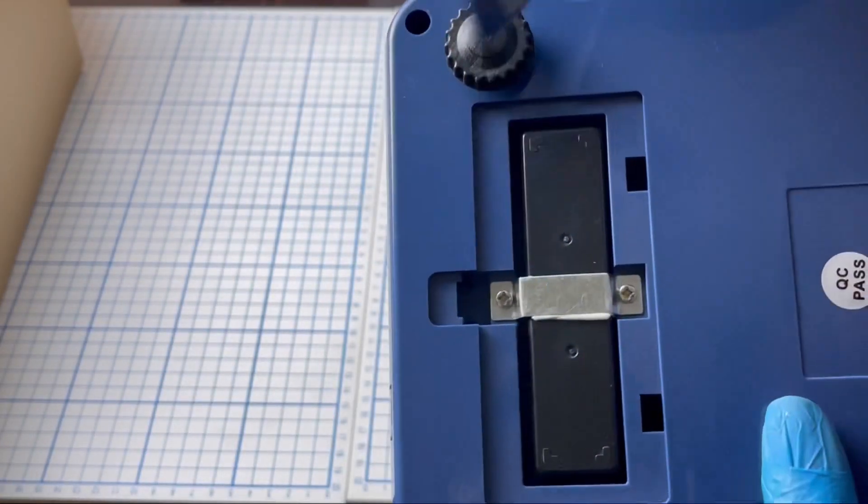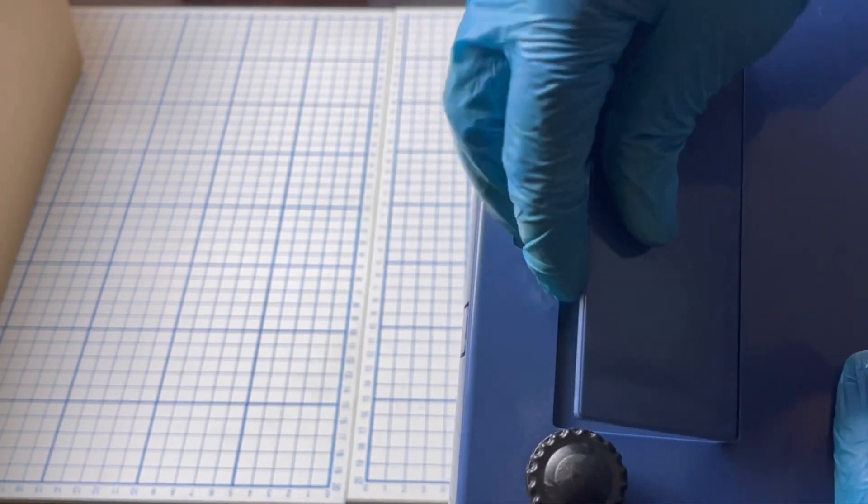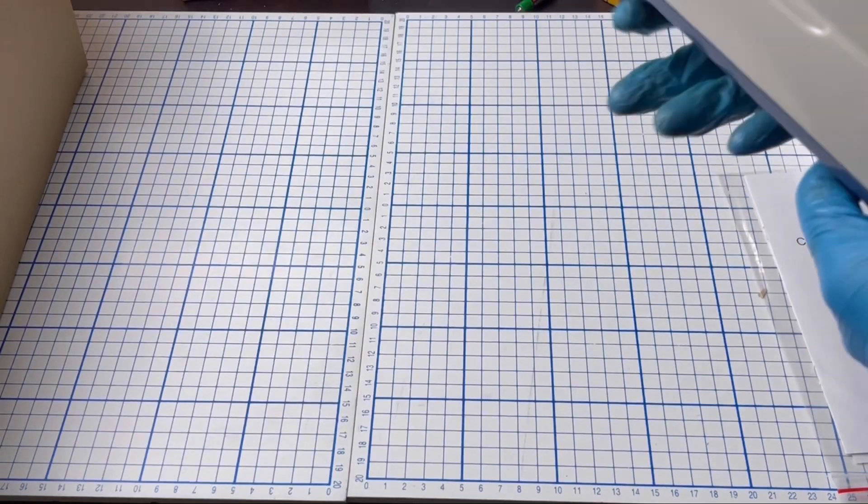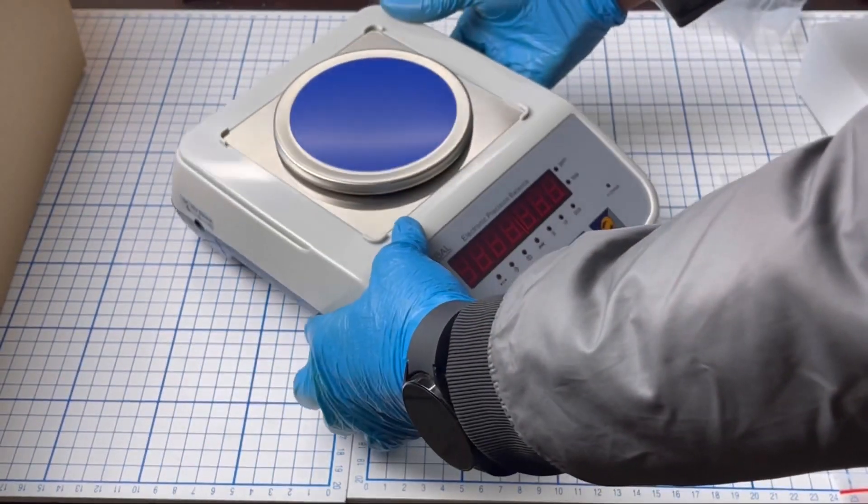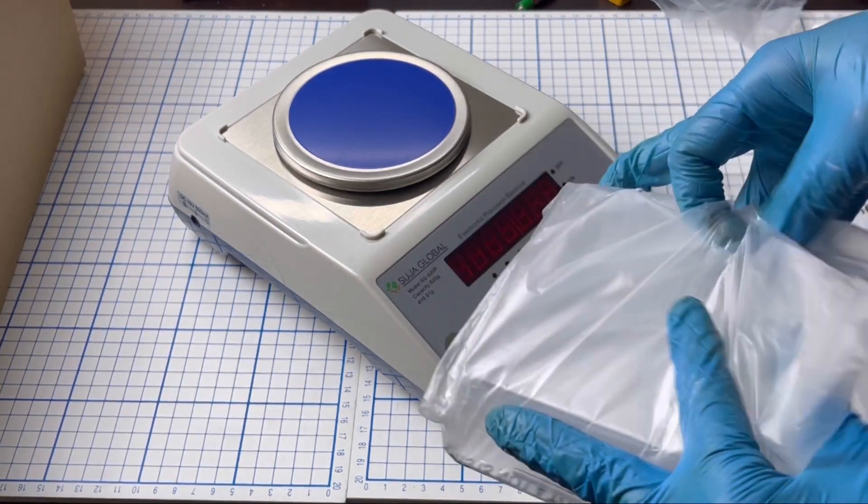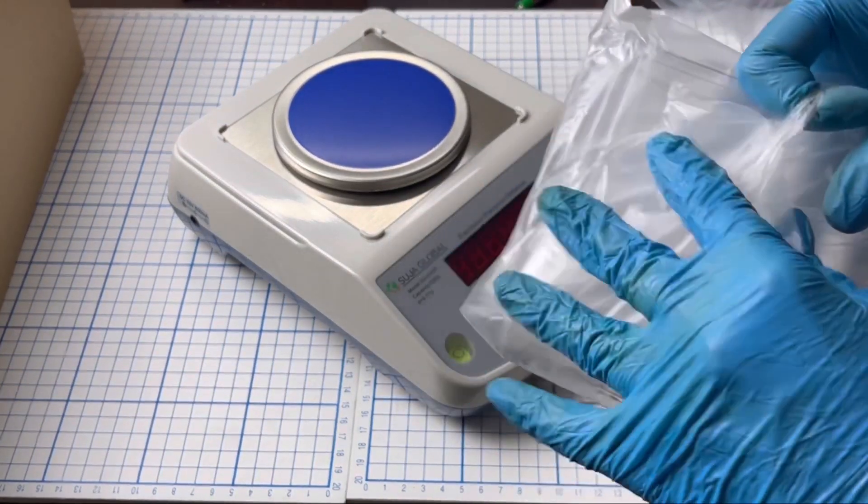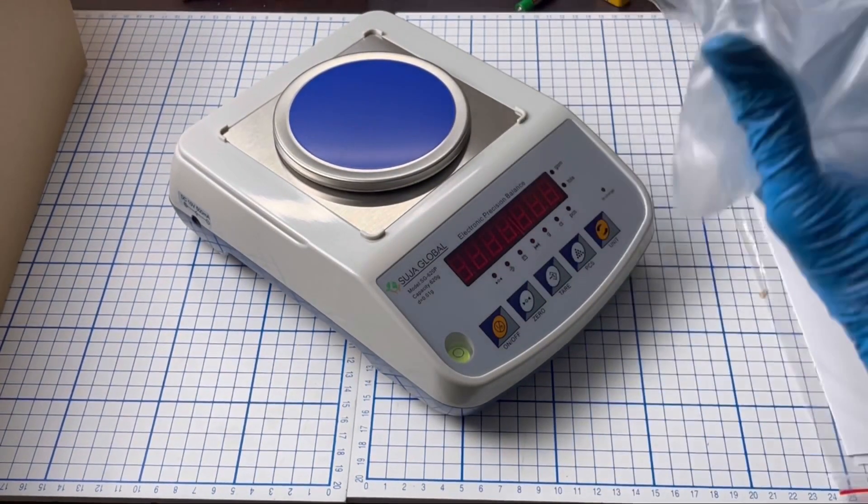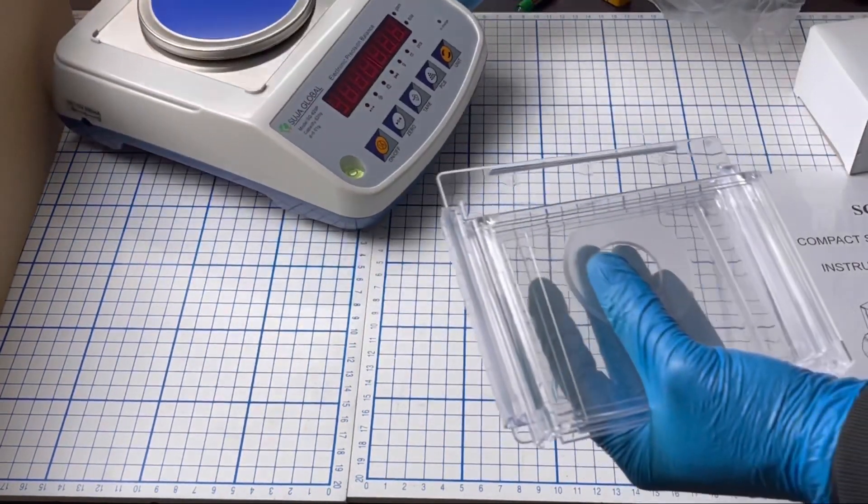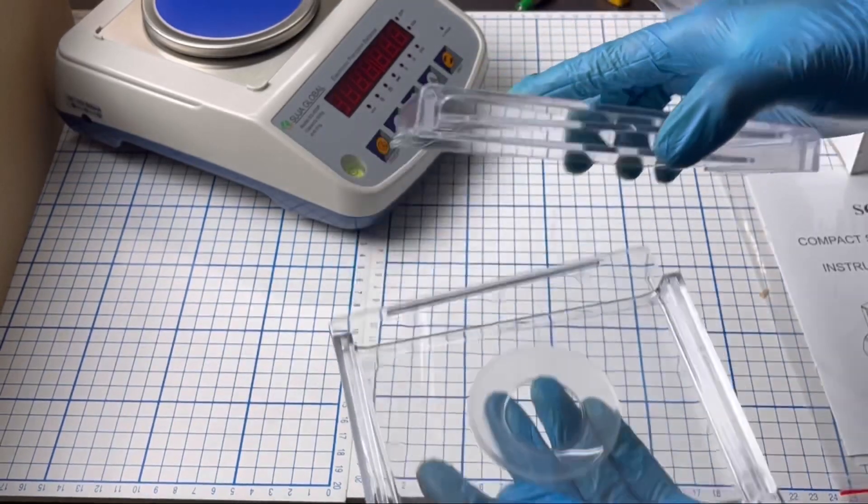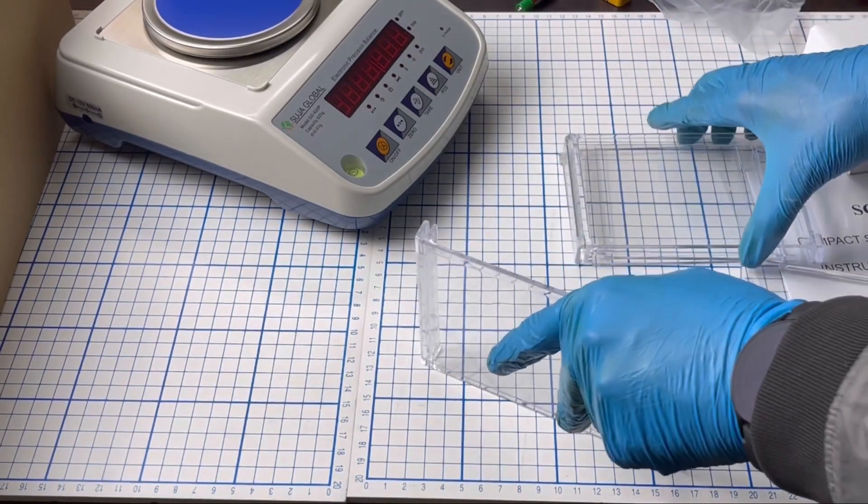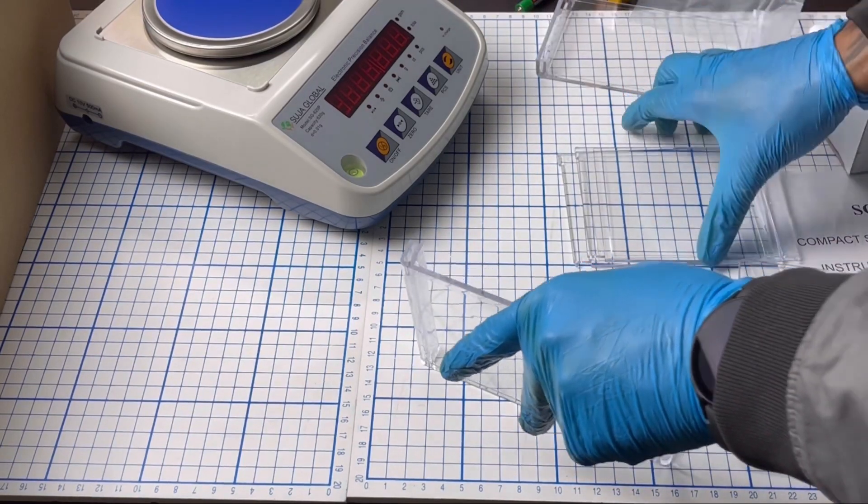QC passed. Here is the battery, built-in battery. Actually, this is so good for regular users. The disturbing thing is changing the battery all the time. This is the cover. I'm going to show you how to set up these things. It's so easy.